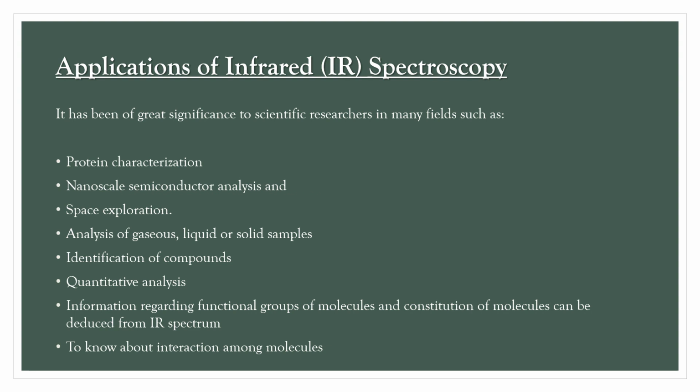Applications of infrared spectroscopy. It has been of great significance to scientific researchers in many fields such as protein characterization, nanoscale semiconductor analysis, and space exploration, analysis of gaseous, liquid, or solid samples, identification of compounds, and quantitative analysis. Information regarding functional groups of molecules and constitution of molecules can be deduced from the infrared spectrum to know about interaction among molecules.